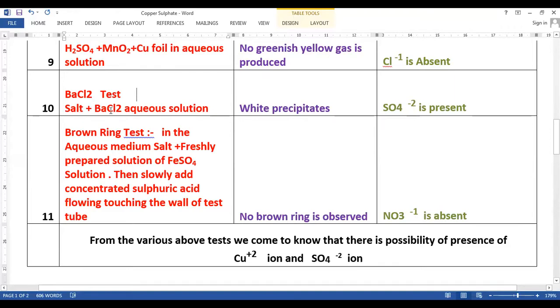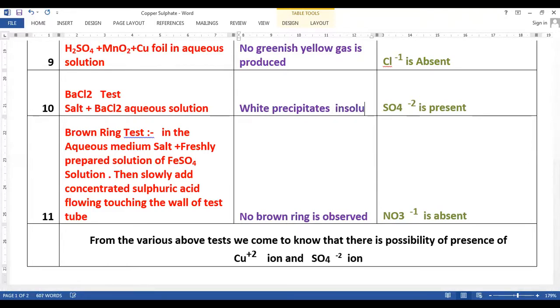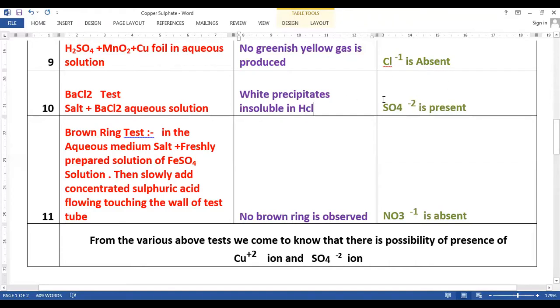We have taken the salt solution and barium chloride aqueous solution and both these solutions are being mixed. We have got white precipitates. These white precipitates are generally insoluble in HCl, and that is how we confirm that SO₄²⁻ is present. At this level we say SO₄²⁻ is present, but we still have to perform the confirmatory test to get full confirmation for the sulphate ion.